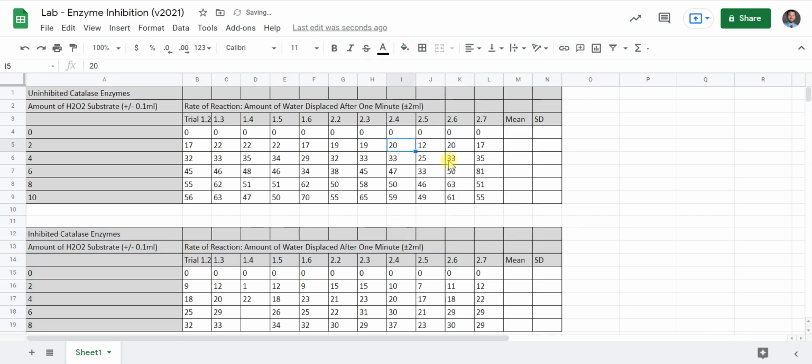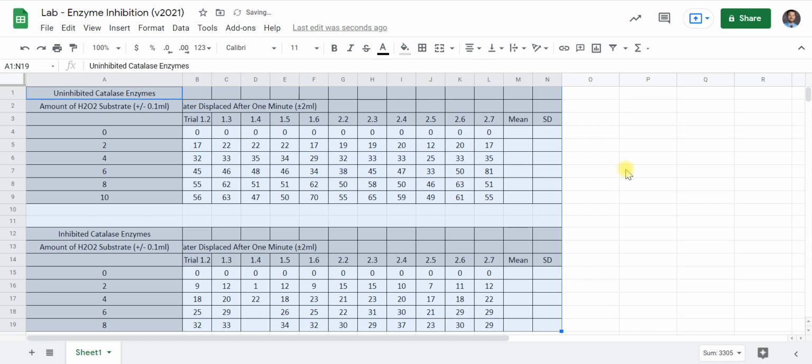And so if we look at it now, you can clearly see where our data is and where we'll calculate the mean and the standard deviation. And yet you can see everything else in our heading. So next thing we're going to do is we're going to try to merge some cells together. Actually, before I do that, let's do this instead. Highlight everything in here, and I'll just go all the way down. We're going to center it. And I'll come over here to the horizontal center. That just makes it look a lot nicer for when we start to put everything together.